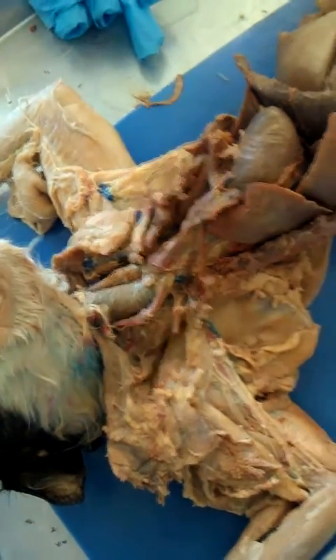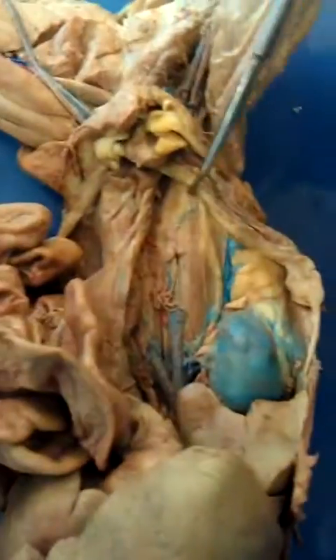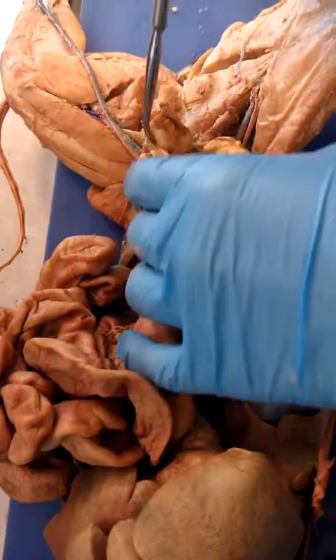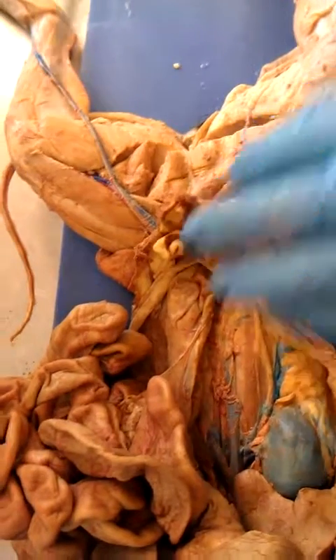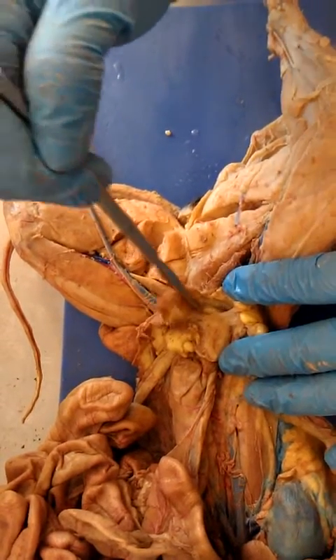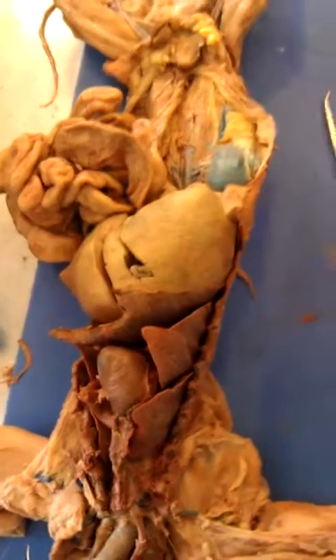The trachea. The urethra and ureters. I couldn't find them. I was like, ureters are right here, and where's the urethra? After the bladder. Hey, Brittany. Urethra. So where's the bladder? Here's the bladder. This bulge right here. On other cats, it might not be as prominent because this is full. So the urethra is going to be this right here underneath, this valve-looking thing. There's two that come off and fill the bladder. And the uterine horns we already went over. So we got it. And that's everything.